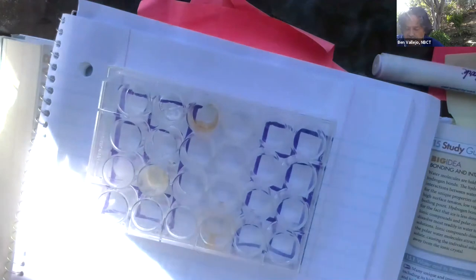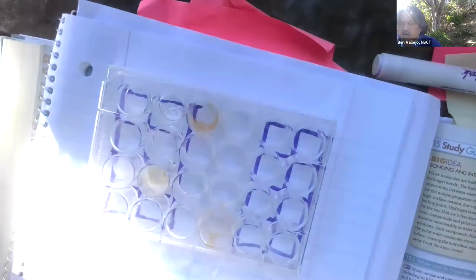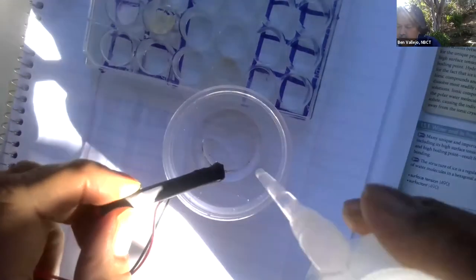So let me rinse off my electrolyte tester. I'm off screen doing it, but trust that I'm doing it. Or no, don't trust that I'm doing it. Watch me do it. There it is right there. I'm gonna rinse it off.